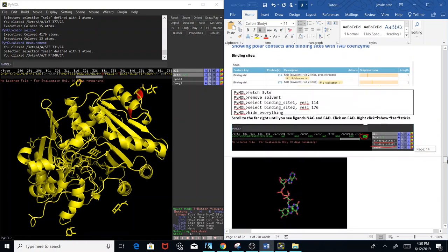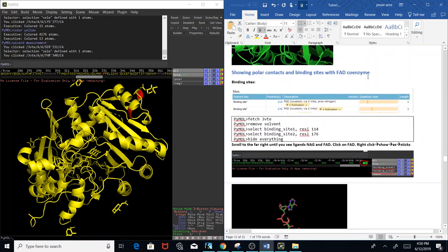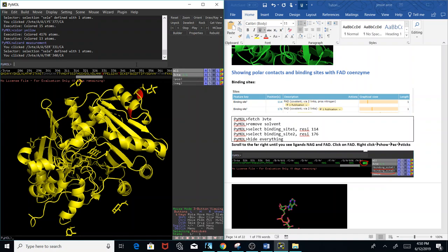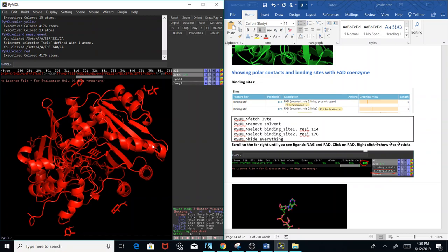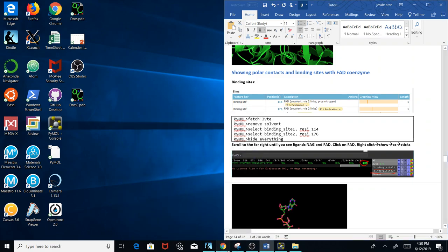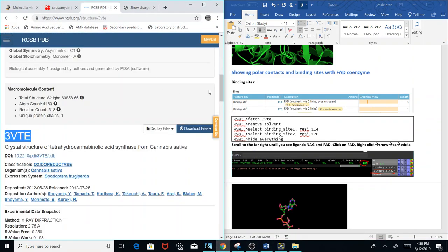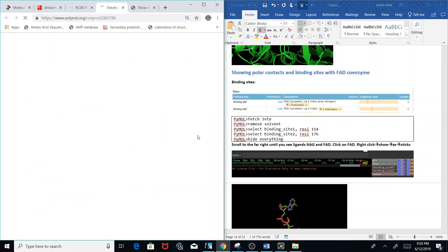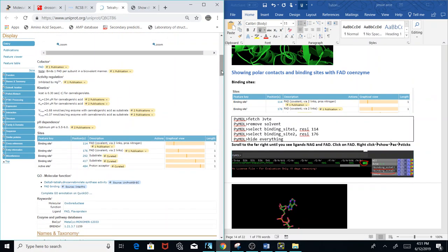Now we're going to show polar contacts and binding sites with the FAD coenzyme. We'll stick with this protein. I'll color this red. I'm going to show you where you can find the binding site of a protein. Go to the PDB file, click on UniProtKB, and it gives you the binding sites with the FAD molecule — coenzyme FAD.